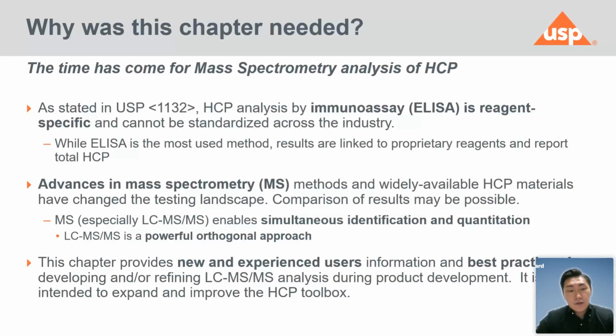This new chapter is really aimed at providing both new and experienced users information and best practices for developing or refining their LC-MS/MS-based approaches for product development. It is intended to expand and improve the host cell protein toolbox along with ELISA.